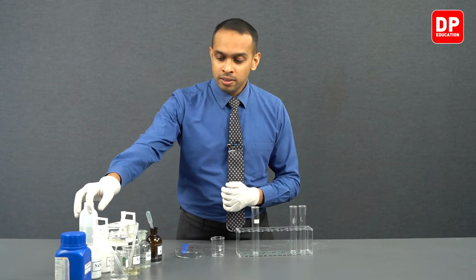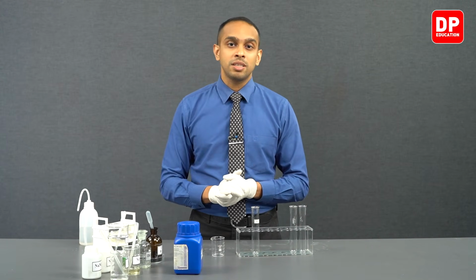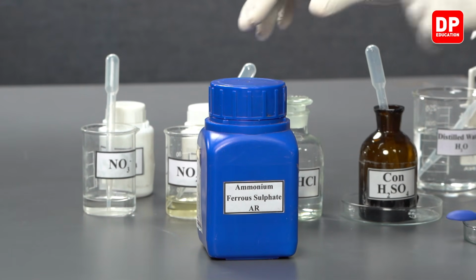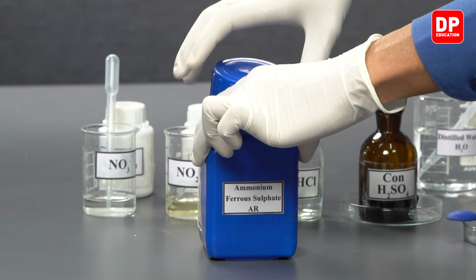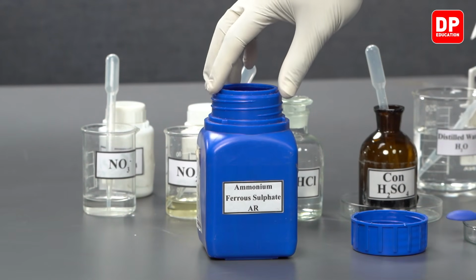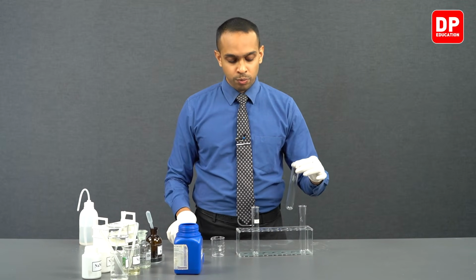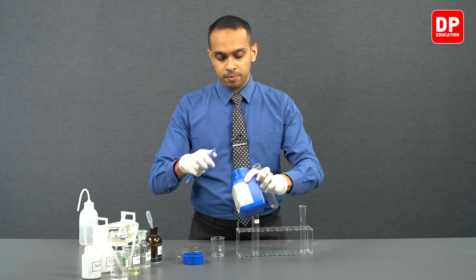In order to start our reaction, we will need a saturated solution of Fe2+ ions. So to produce this, we will be using ferrous ammonium sulfate or ammonium ferrous sulfate that we have over here. We are going to take a small sample of ammonium ferrous sulfate into a boiling tube.